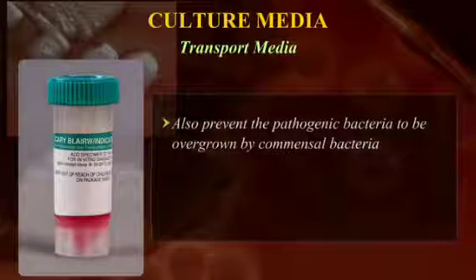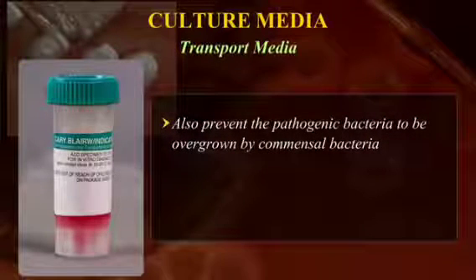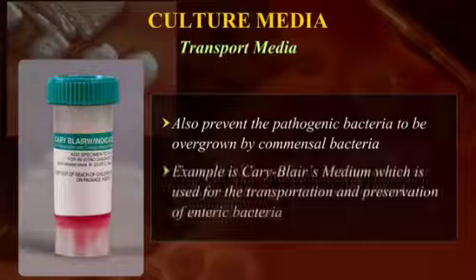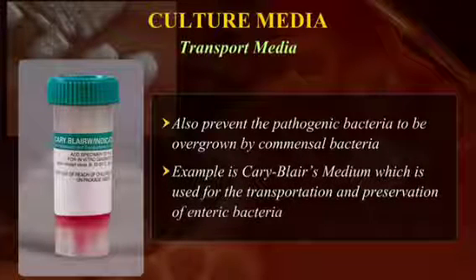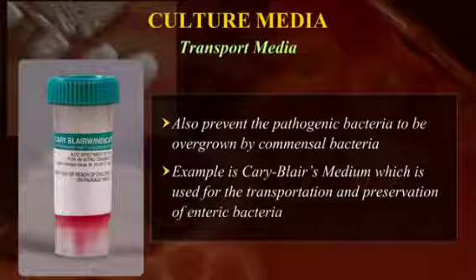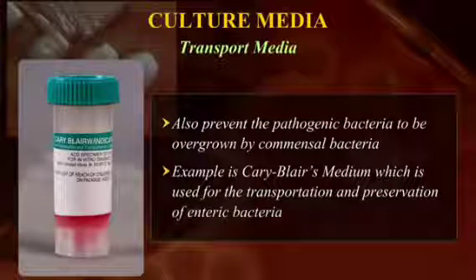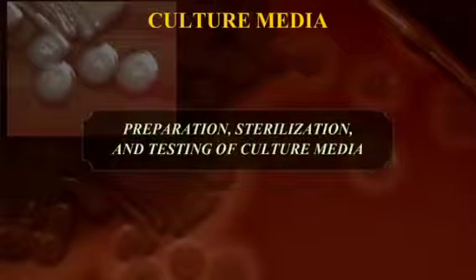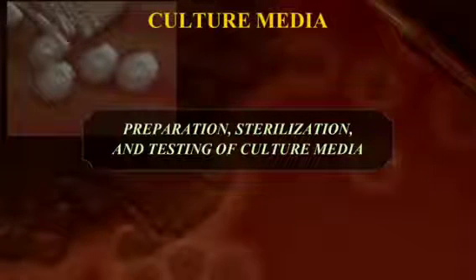These also prevent the pathogenic bacteria from being overgrown by commensal bacteria. An example is Cary-Blair medium, which is used for the transportation and preservation of enteric bacteria. Preparation, sterilization, and testing of culture media.